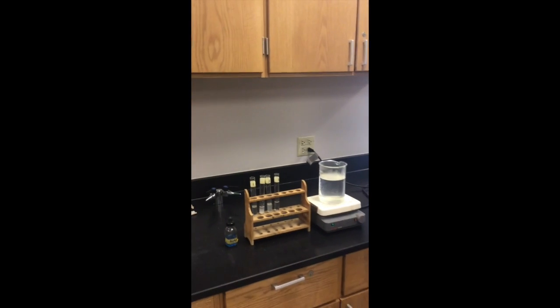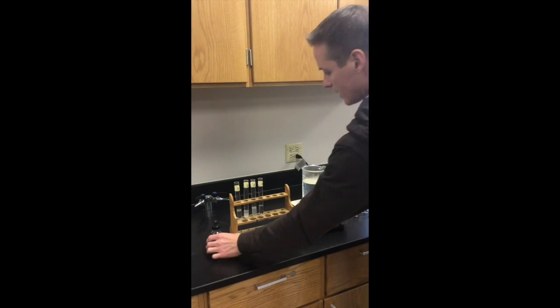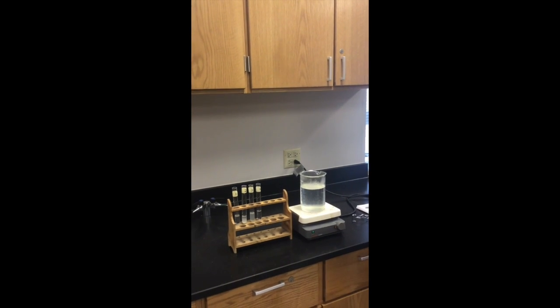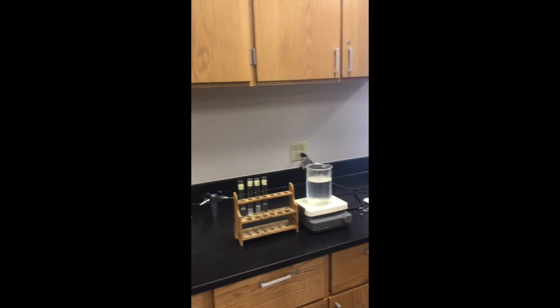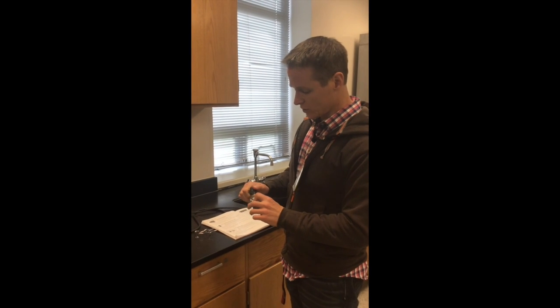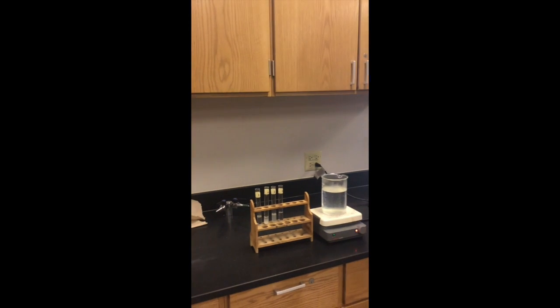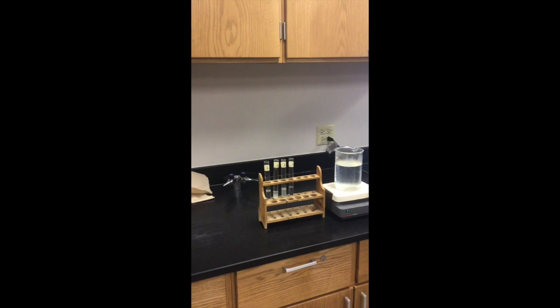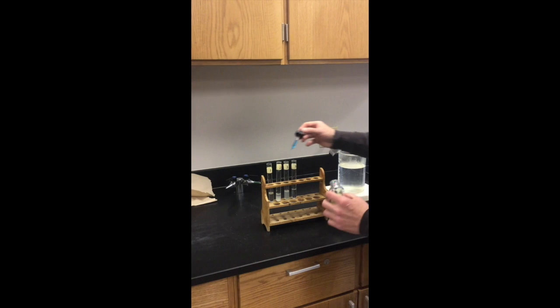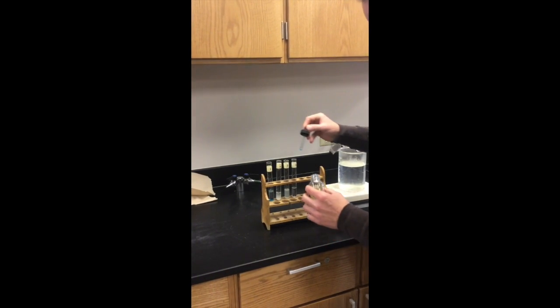This is the final test, and we can see we have unknowns 1 through 4 right here, and this is the Benedict's test. Benedict's tests for carbohydrates as well, but not long-chain carbohydrates, where this one tests for sugars, and sugars are kind of the simple ones. And so we will go ahead and add in our Benedict's, and we are going to add several drops to this one, and we'll again look for a color change to like orangish, greenish, yellowish. Right now it's blue.